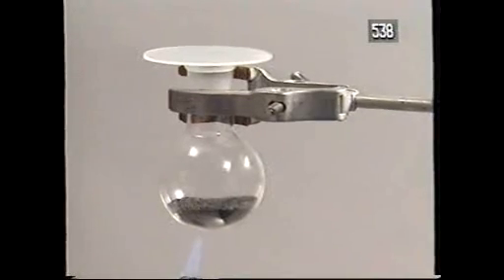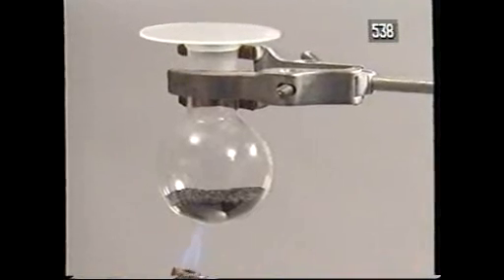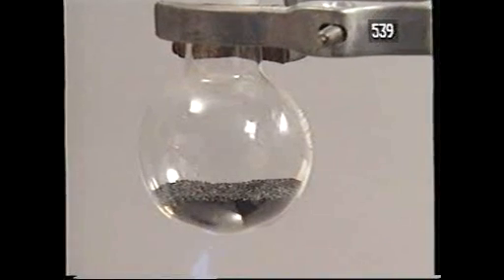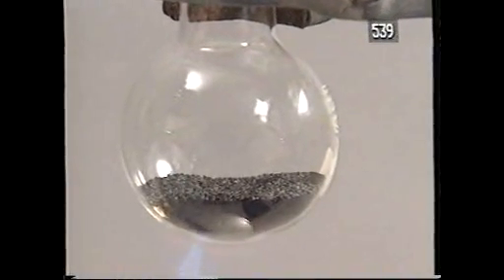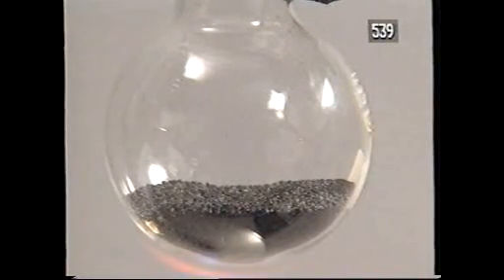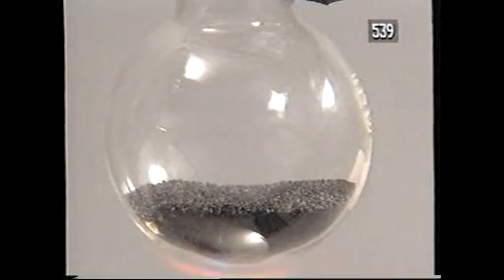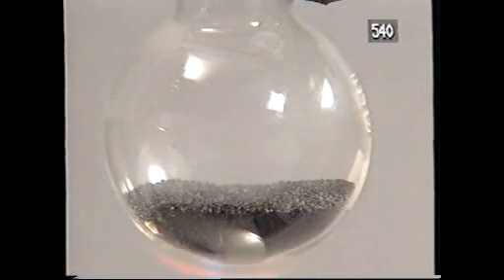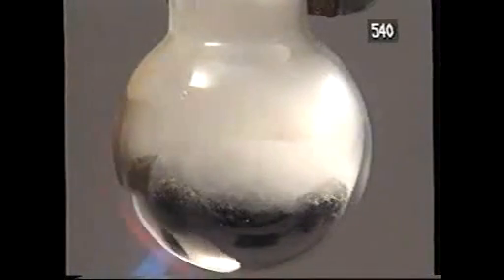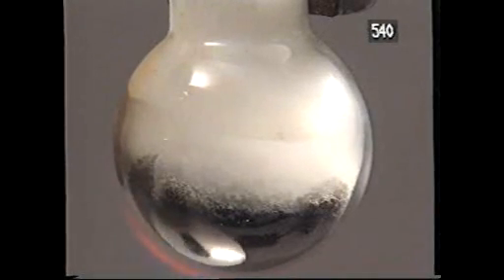Ammonium chloride was first discovered in the Middle East, in soot from furnaces that had been fired with camel dung. Europeans, being short of camels, resorted to mixtures of salt, urine and soot. Eventually, they found that soot alone was often enough, and that's what I'm using here. I'm just heating it in a loosely covered flask. You can see fumes above the soot, and some nice turbulent motion inside. The surface of the soot is turning white.